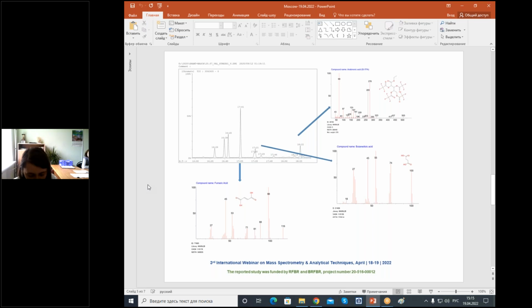Other organic acids are represented by the following compounds: butanoic acid, glycolic acid, oxalic acid, 2-butenedioic acid, monoethyl malonic acid, succinic acid, glyceric acid, 2-oxopentonoic acid, malonic acid, 2,3,4-trihydroxybutanoic acid, butyric acid, arabinoic acid, ketosuccinic acid, fumaric acid, 2-propanoic acid, and citric acid.